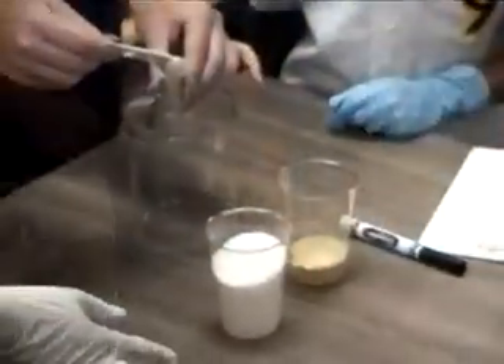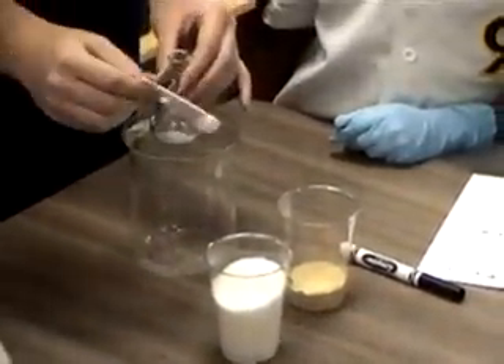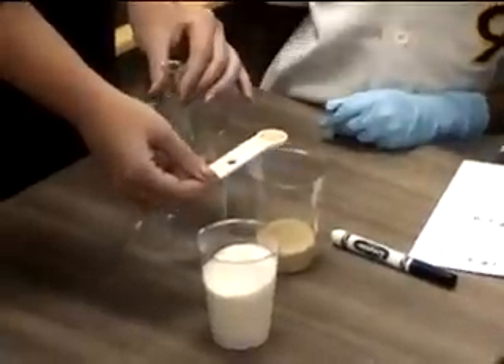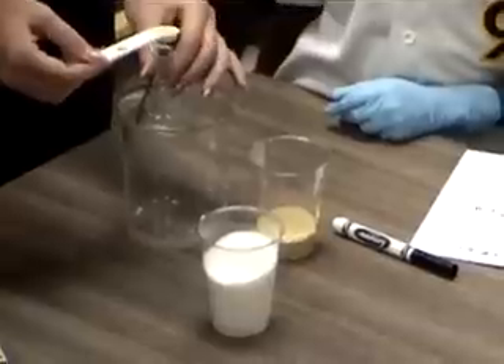If your students have not done many experiments before, it's important to model exactly what you want them to do. Students may not know the appropriate way to handle glass, measure, pour water, or many other things you might assume they already know.